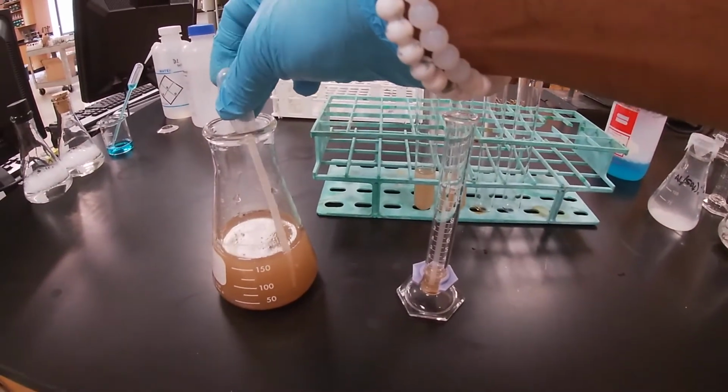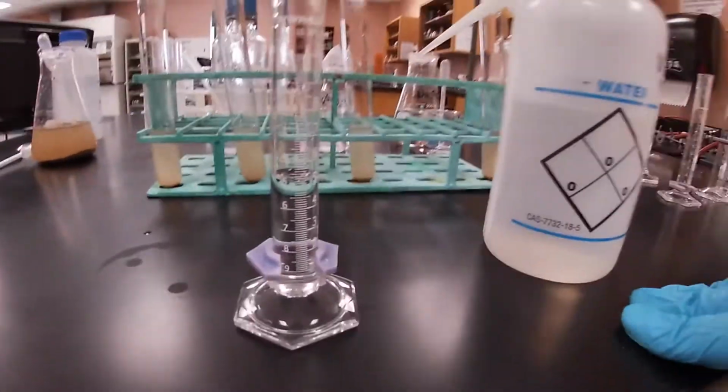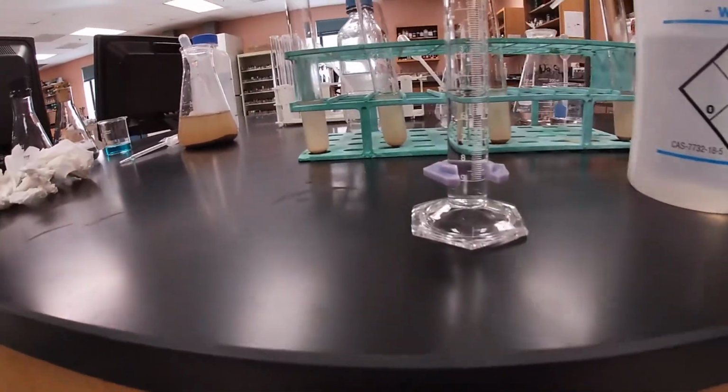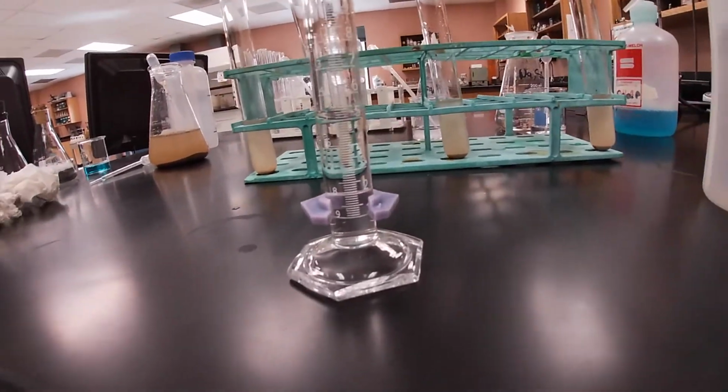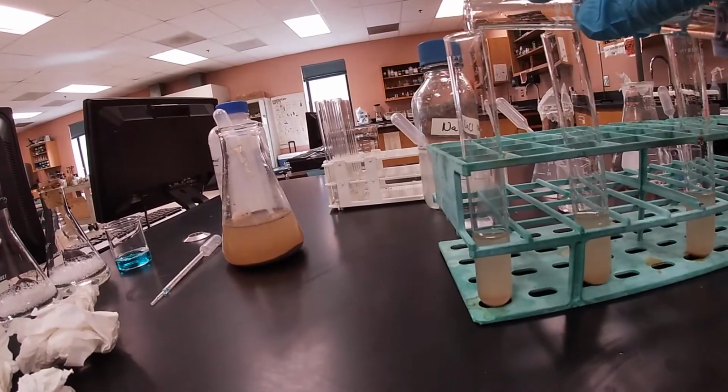So we'll do the same thing for third and fourth, and we'll come back when I'm done. So we measured out 5 milliliters of the water. And so as you can see, here we have the water, and we're gonna put that in our reference test tube.